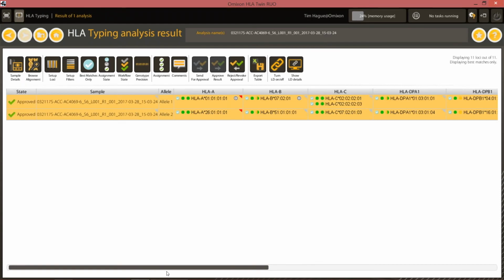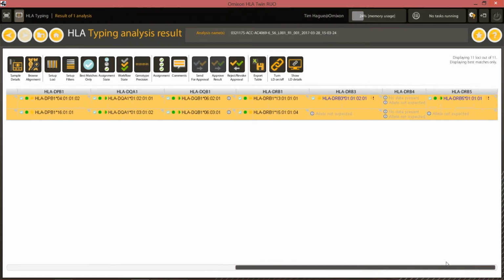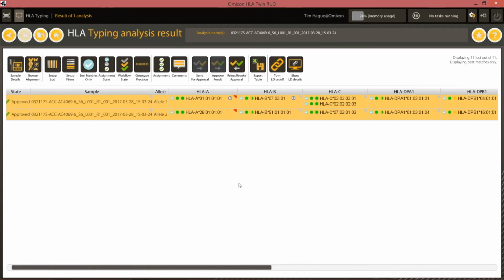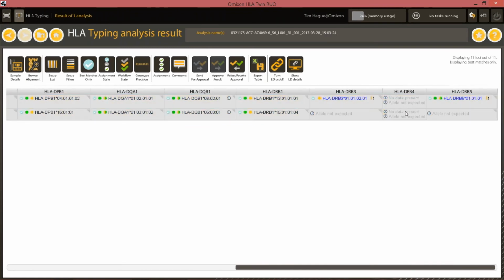One of the other features that you can see at this level is something called LD up here, which is the linkage disequilibrium check. This was actually added in a previous version of the software, but it's been polished up quite considerably in this version. It's mostly for detecting the hemizygosity of your DRB3, 4, and 5 results. It may also help you to spot if you've had a locus dropout. If you have a locus dropout, a poor amplification for some reason in HLA-B, it's usually fairly obvious. You have 0 HLA-B results. But for HLA-DRB4, it might be less obvious because this person may or may not have that particular locus.